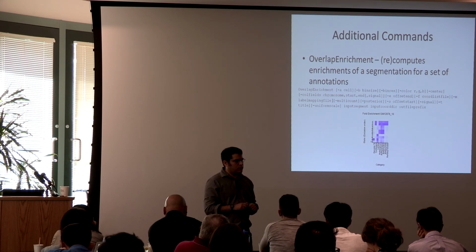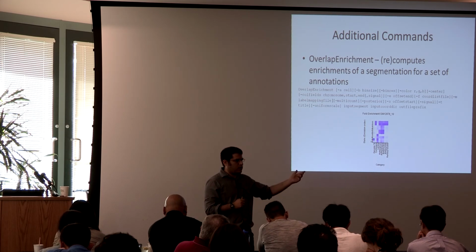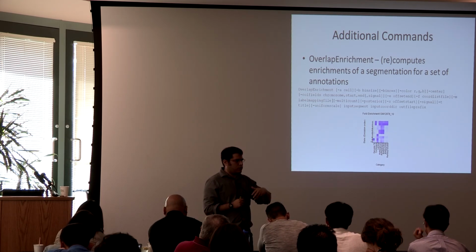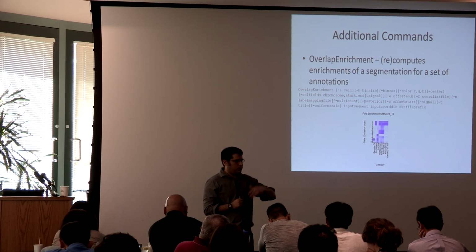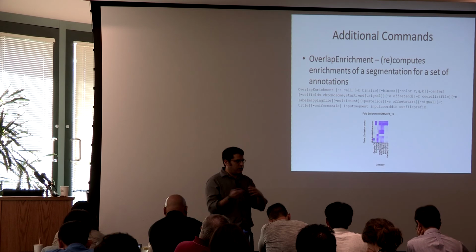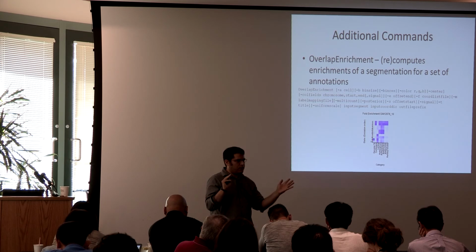So it's the type of thing where it could be the case that you completely lose a transcription mark, but the enhancer marks are unchanged. If you care about transcription marks, that would be a big change. But if you just care about enhancer changes, it's not a big change.